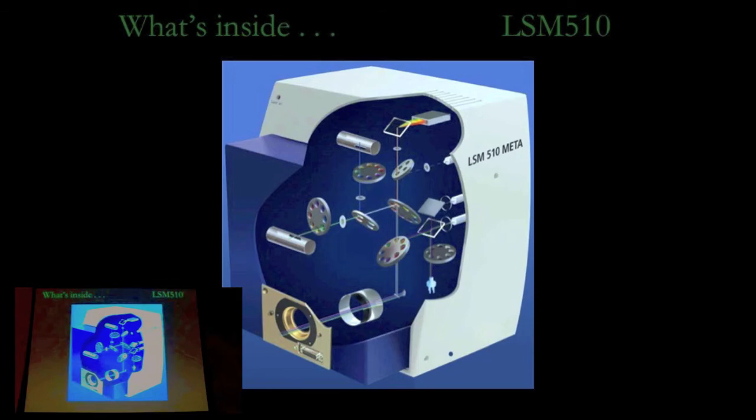And then there's a chain of electron multiplication. You're applying a voltage down the length of the tube, accelerating those electrons. They hit another surface that causes more electrons to come loose, and bounce on down through the detector. There are multiple stages of that electron multiplication. And so at the end, you're collecting a current from this cascade of electrons, and that's going to be proportional to your signal.